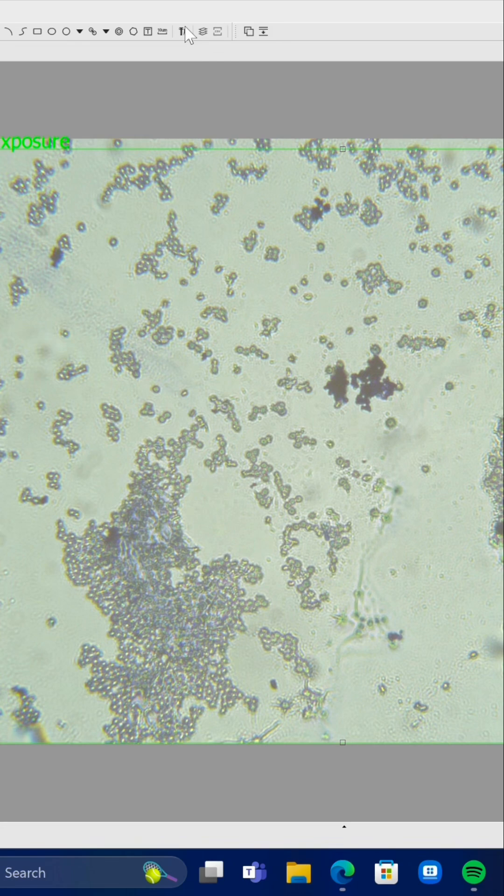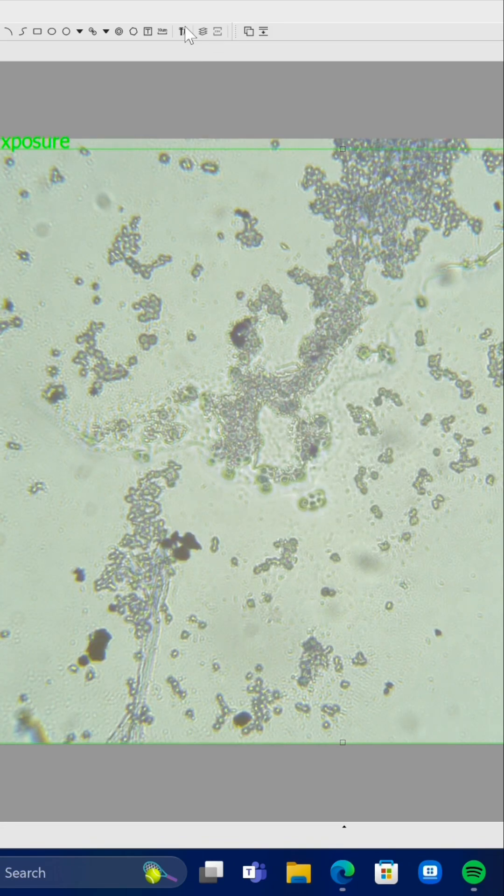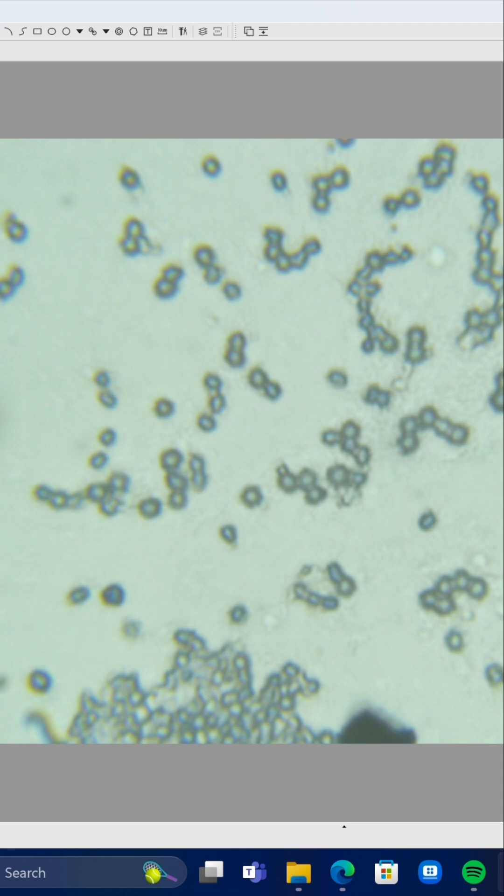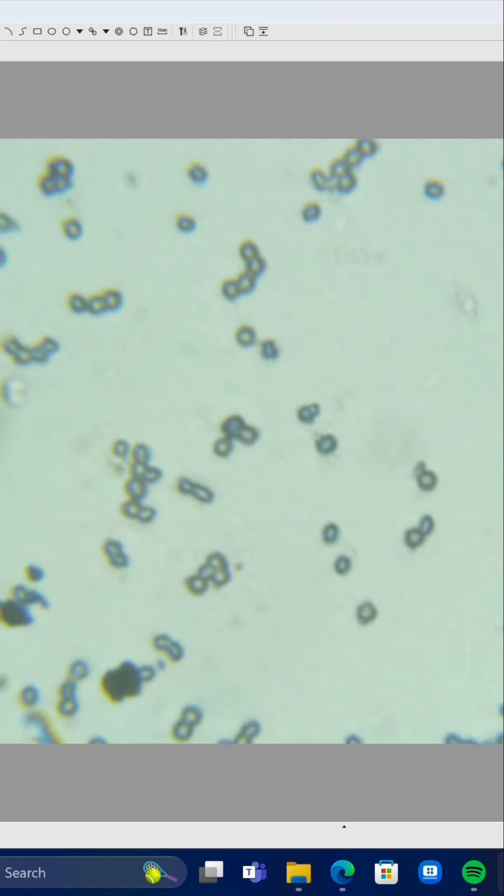So first, I was able to identify two different types of microorganisms. The first one is a type of bacteria called a cocus. Now cocus means that it's a spherical shaped bacteria, do you know what I'm saying? That's why we can see bare circles in that fam.